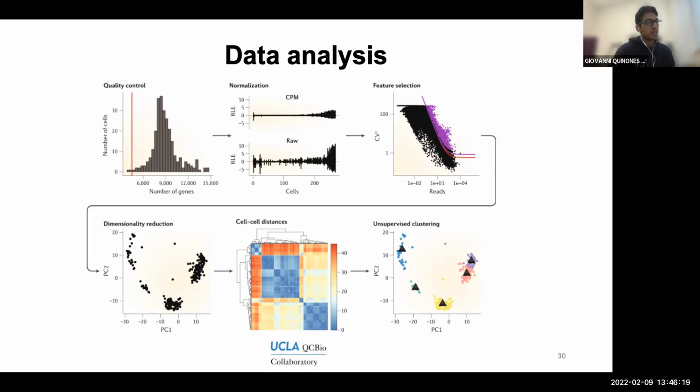So before we start with the first part of the data analysis, I think this is a good point to make sure we're all on the same page in terms of our RStudio setup and the data. Somebody's asking what publication this slide is from. Oh, I didn't include a reference. I forgot to include it, but when I share the slides with you, I'll update it.